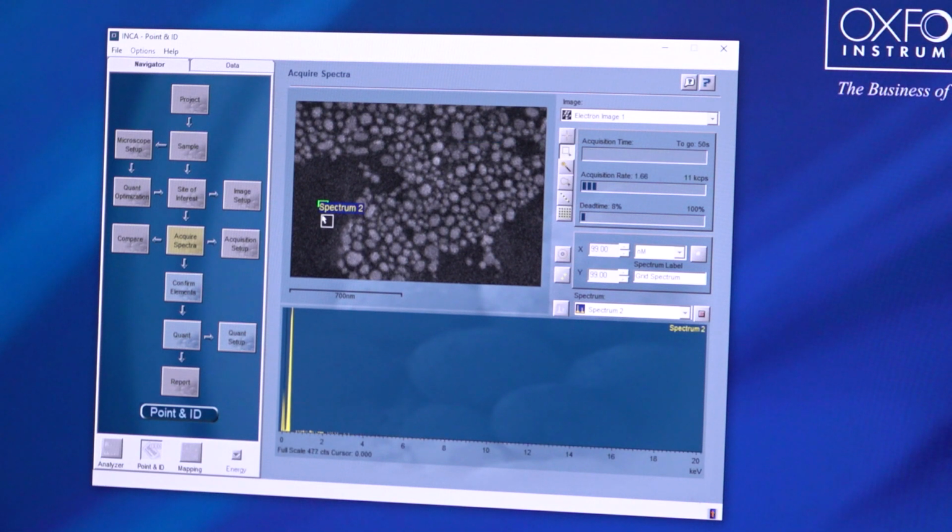Now I am doing the analysis in the black region. So here you can see that no gold peak is popping up. Only the carbon peak is there. That means the black region is purely carbon, whereas the white region is showing some amount of gold. In a minute we will come to know how much is the gold composition in the white or bright region.